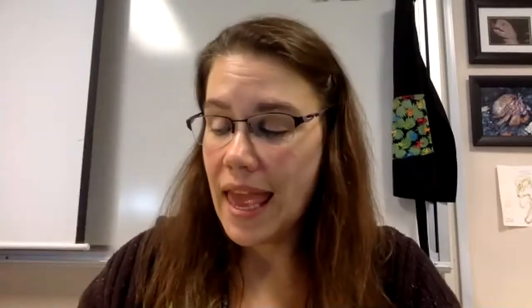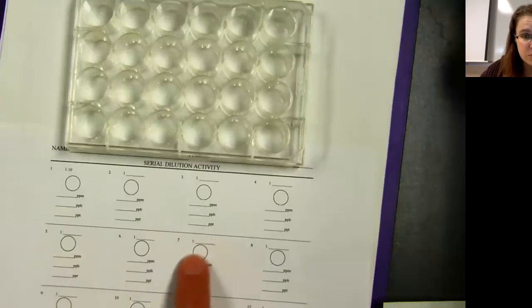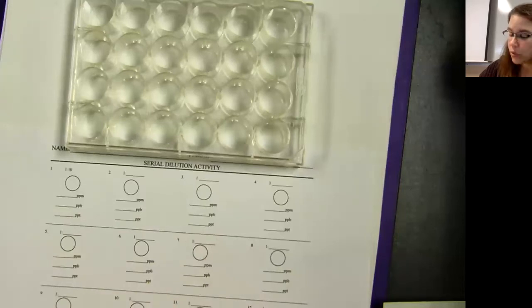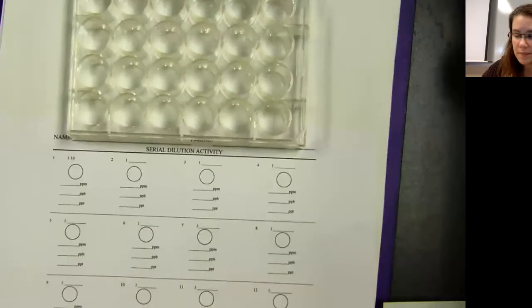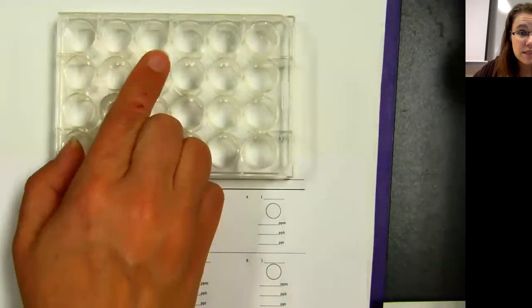You will need some toothpicks or something like toothpicks. You'll need your pipette. You will need some food coloring, and you will need some small containers. So in your notebook, you're going to make an area like this worksheet. I'm going to give you a copy of this worksheet. You could print it off, or you could just make it in your notebook. You're going to need 12 circles like this. And you're going to need 12 little containers as well.